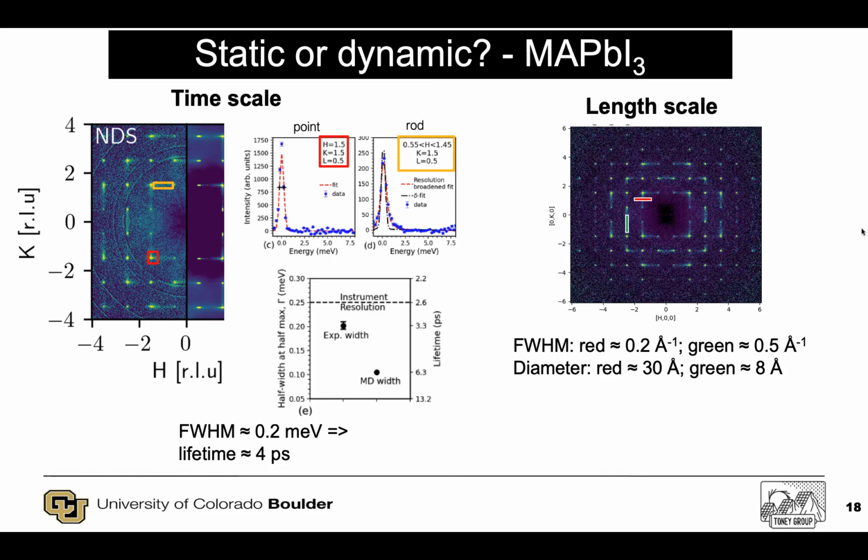When we look across the rods, we see diameters of the fluctuating domains on the order of about 3 or 4 nanometers. And then orthogonal to that it is more or less 1 unit cell, consistent with this kind of structure that I talked about.